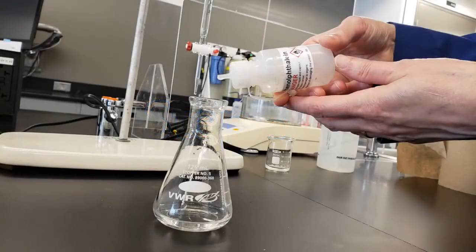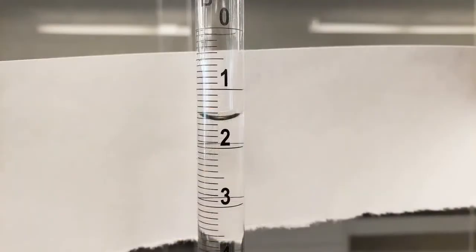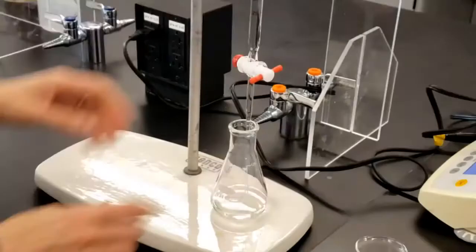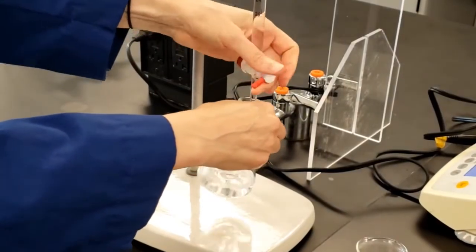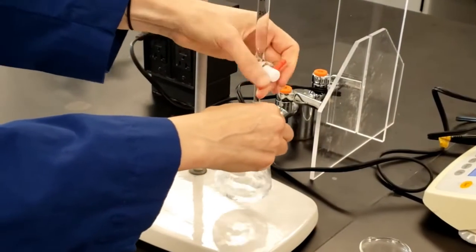Always take note of the initial volume in the burette read to 2 decimal places. In the first titration, sodium hydroxide solution can be dispensed rapidly to determine the approximate volume of the base required to neutralize the acid. The trials which follow should be much more efficient if you use the same approximate mass of solid.